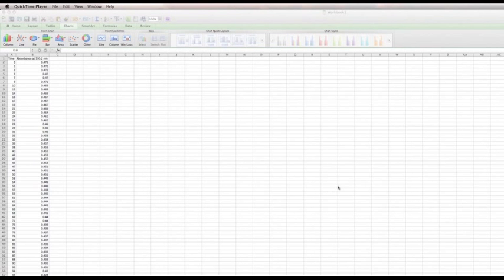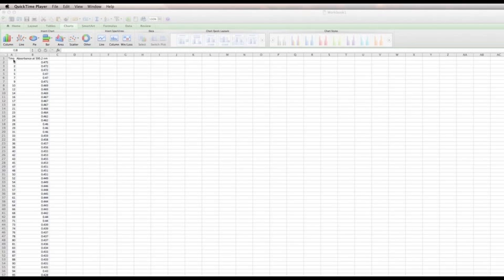This is the post-lab analysis for the crystal violet kinetics lab. You should have some data that looks something like this, with time and your absorbance values — maybe two sets of data; we'll just do one of them here. We want to plot this according to the three integrated rate laws, and it's pretty easy in Excel to manipulate the data and get the plots.